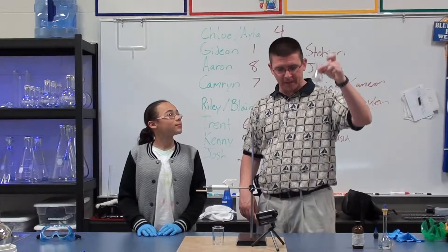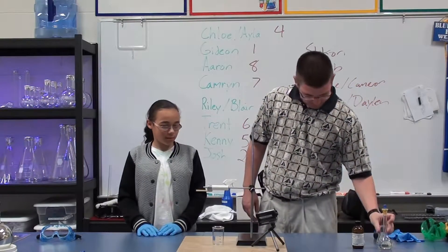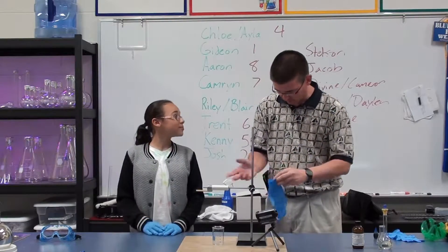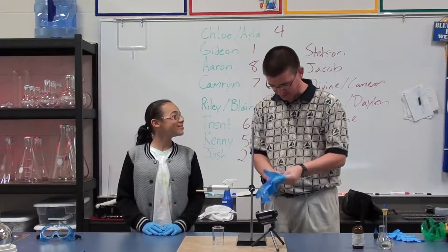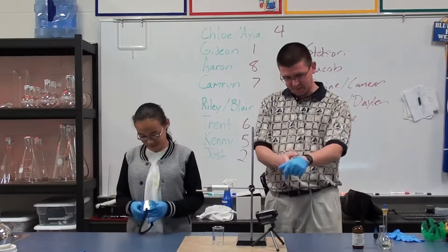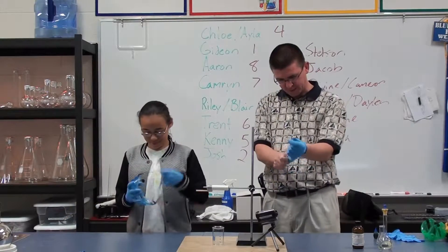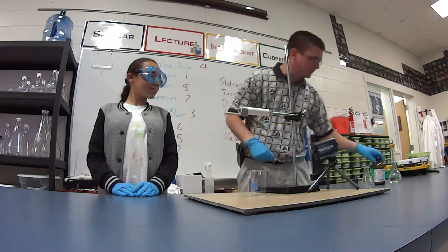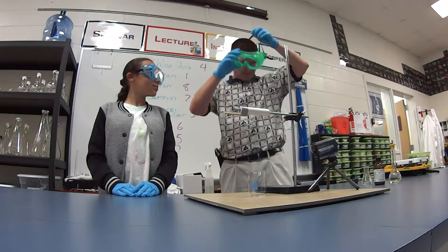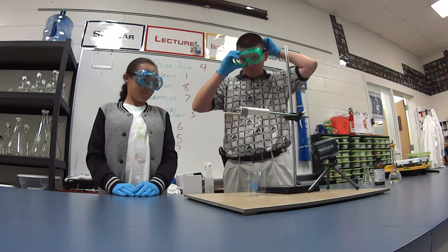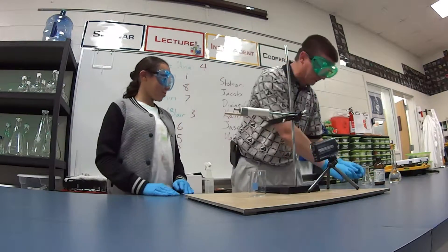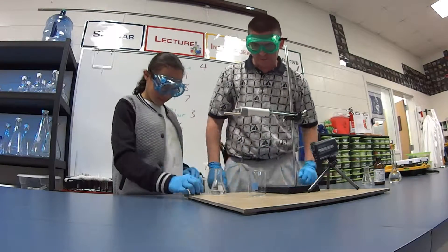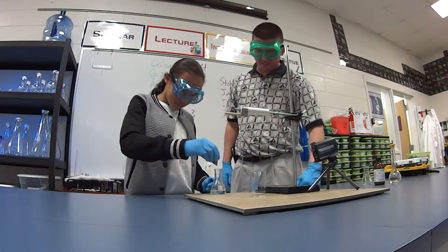We're going to pour the hexamethylenediamine in first. Let's go ahead and put some gloves on. You've already got yours — I'm going to put mine on. And you can go ahead and get your goggles there too, because these chemicals are things we don't really want to get on us. We're going to add a little bit of food coloring — just one drop into the hexamethylenediamine.